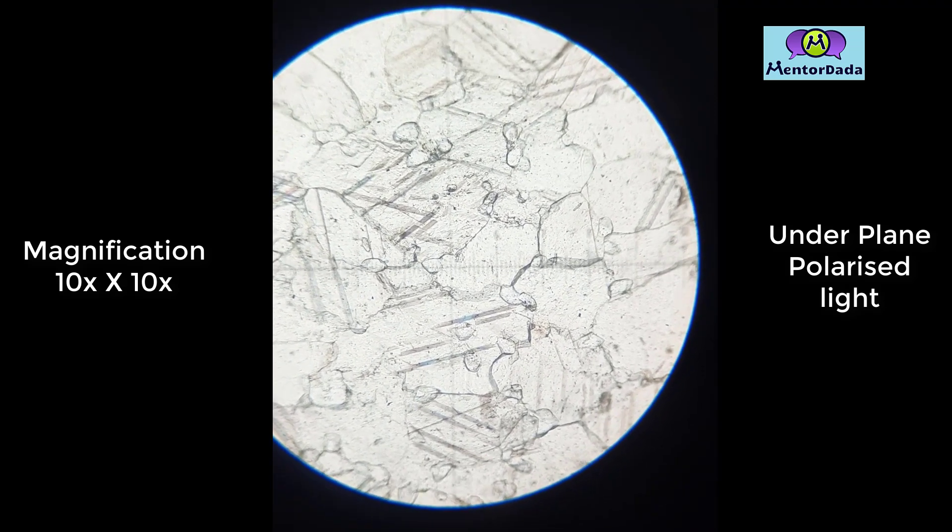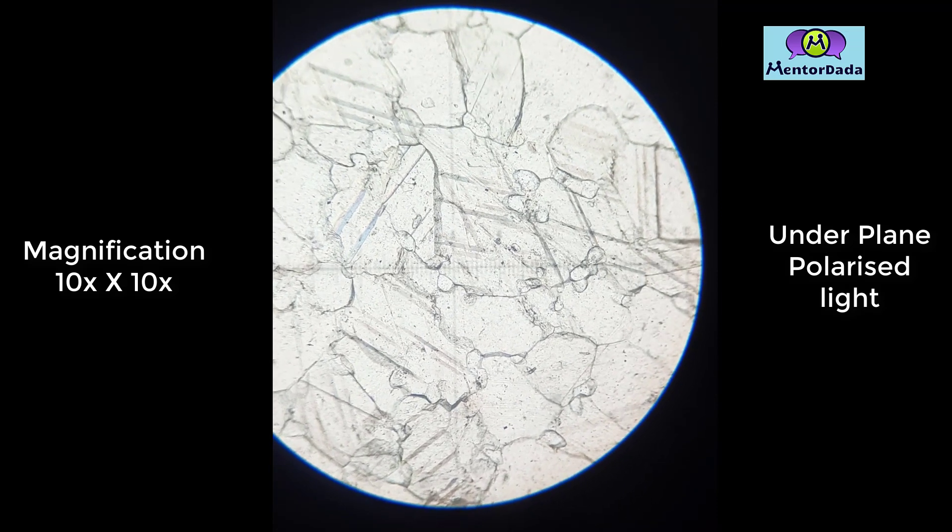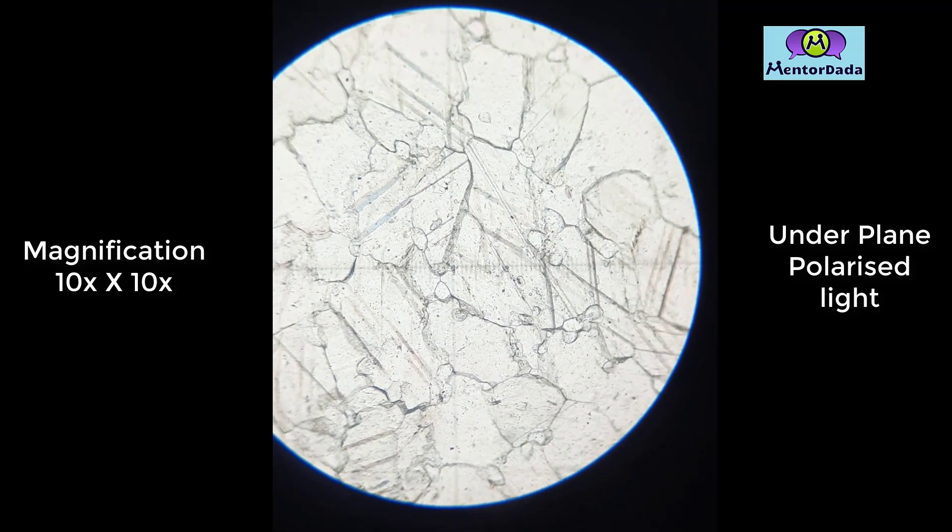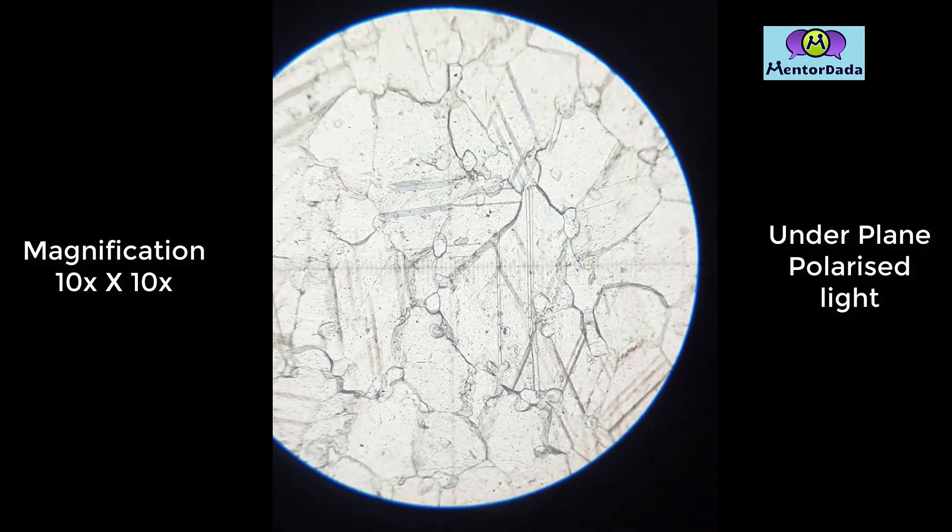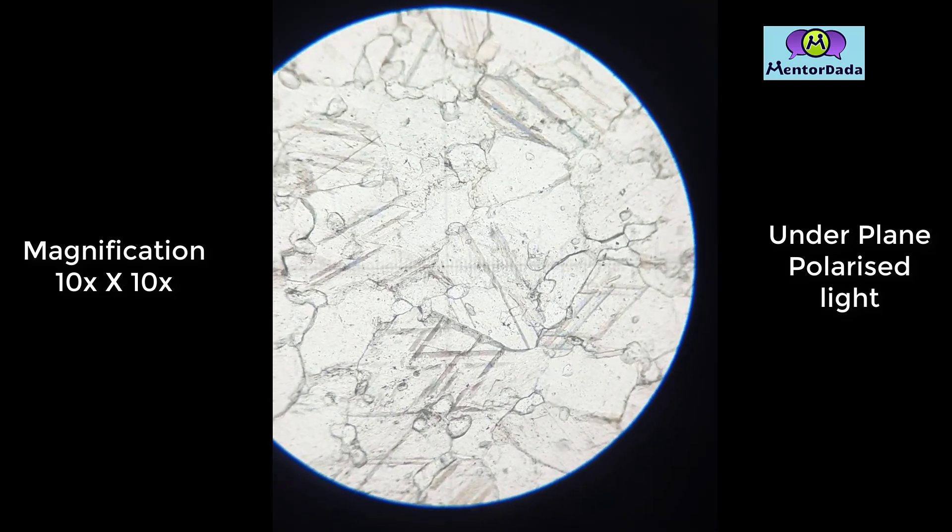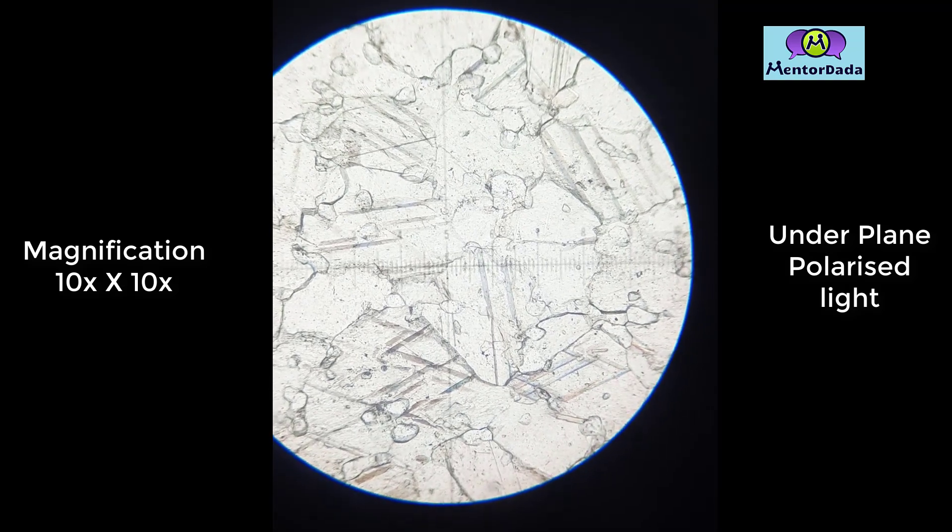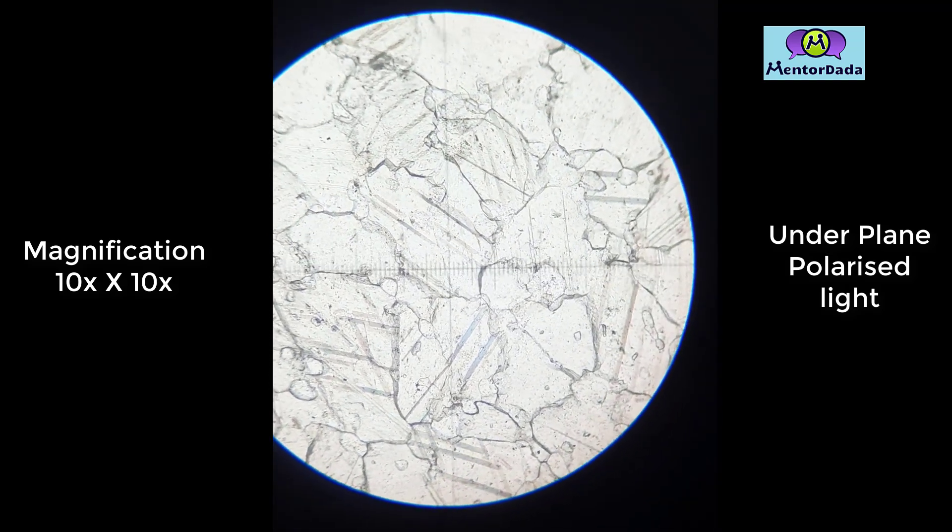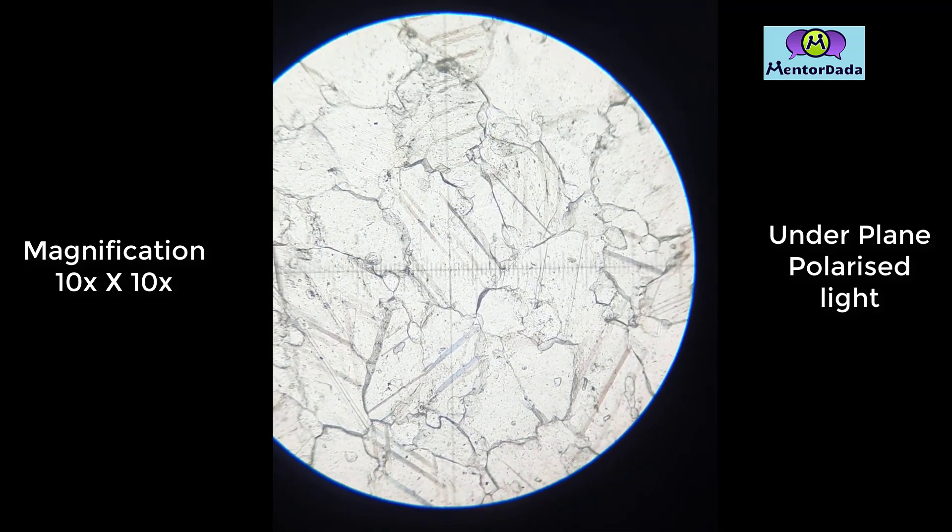As we rotate the stage of this microscope, the mineral shows no color change. We can see that the mineral shows no significant color, so we can say the mineral is colorless.